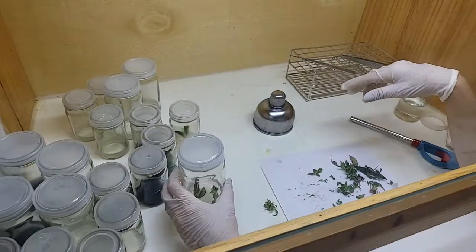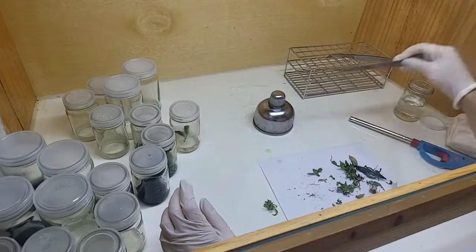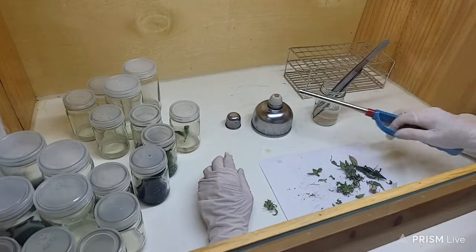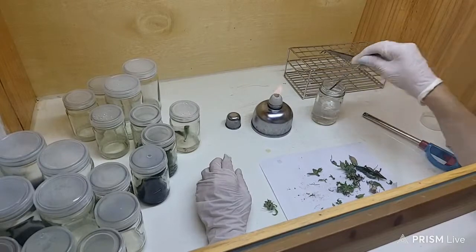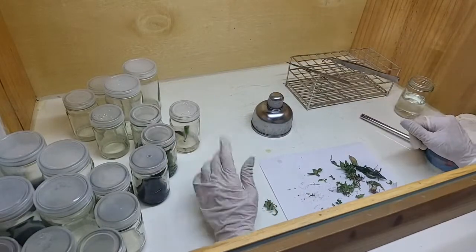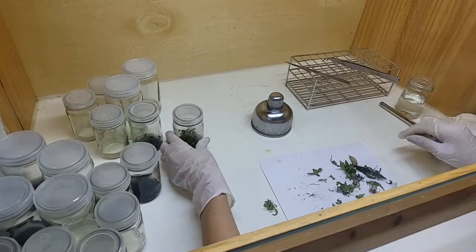It's ready to go on the shelf where the grow lights are. You see the equipment has fallen down, so we're going to dip it in 95% alcohol and then burn it again for at least 10 seconds. Then we start with the next one. That is all for today — bye bye!